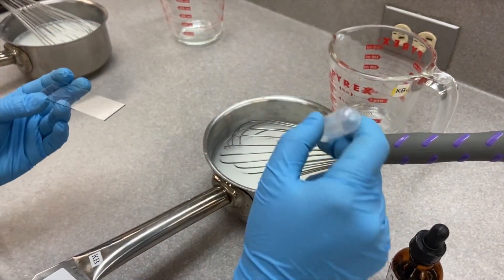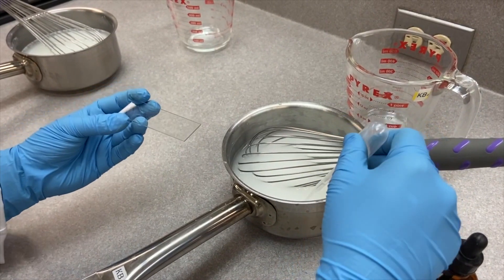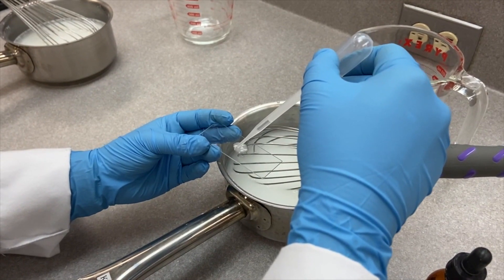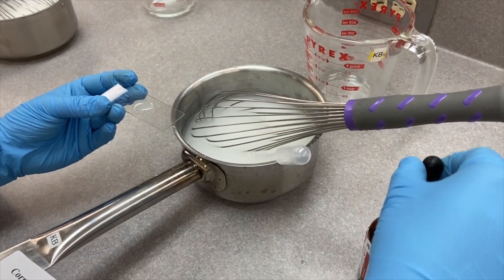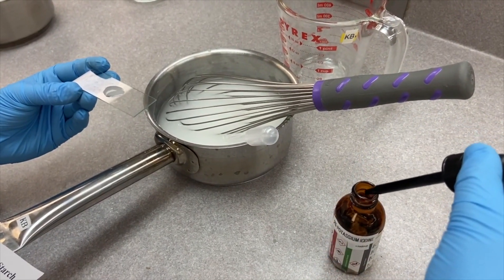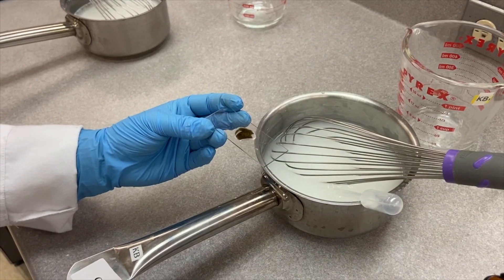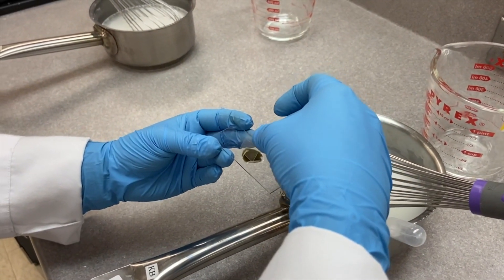Now we obtain a small sample of the cornstarch-water mixture without acid on a microscope slide, and put a drop or two of potassium iodide on it. Make sure it covers the sample — you can see the color change. Put a cover slide on and look at it under the microscope.